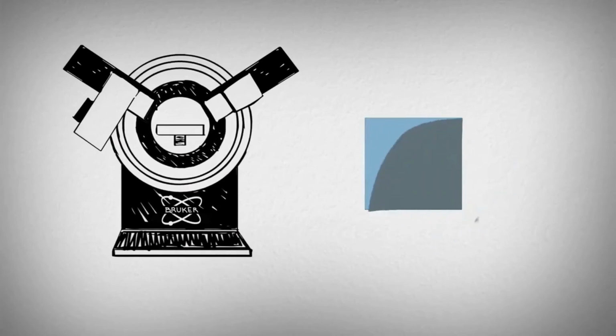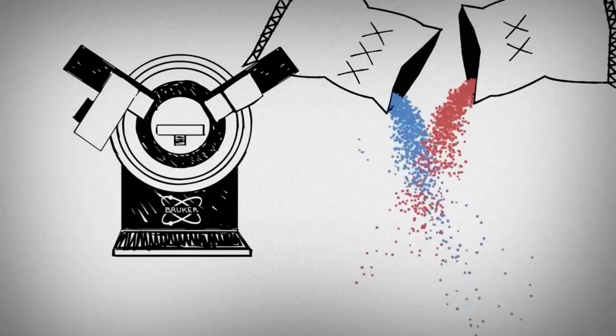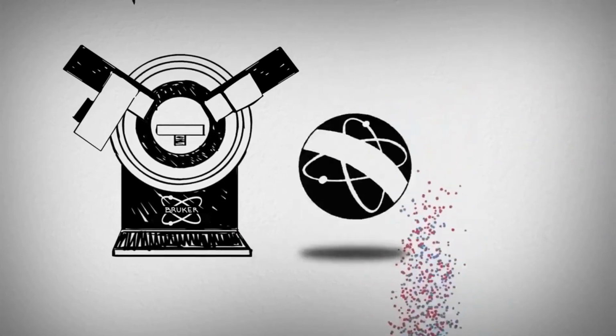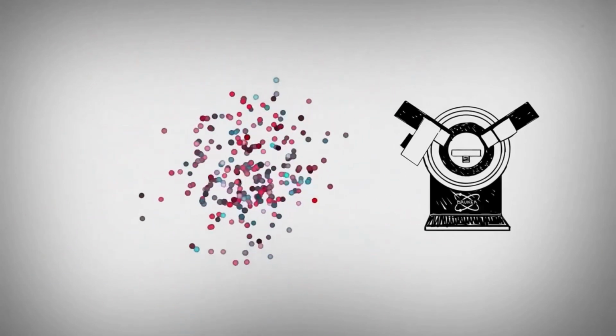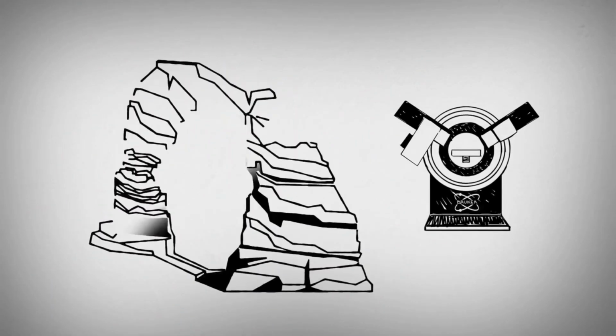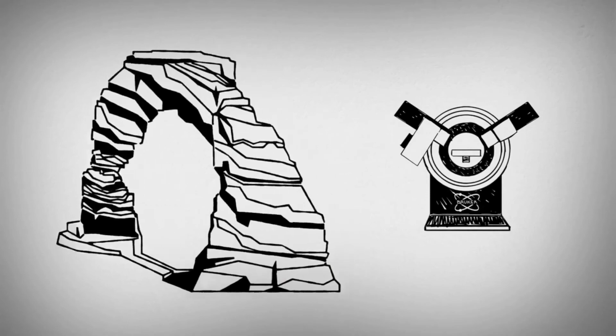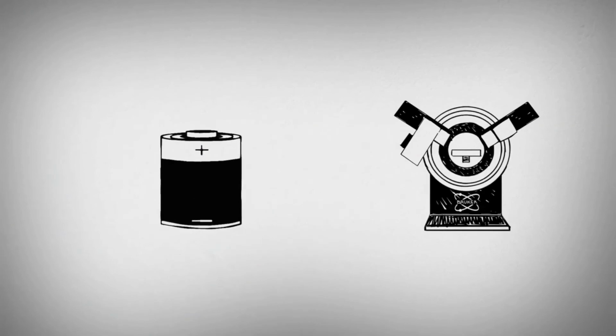This technique of X-ray diffraction is used today for a wide variety of materials, ranging from single crystal epitaxial thin films to polycrystalline mixtures of powders and even randomly oriented amorphous materials. X-ray diffraction helps scientists to develop new pharmaceuticals, classify rock formations based on their mineral components, and understand how the arrangement of atoms affects the behavior of energy storage materials.